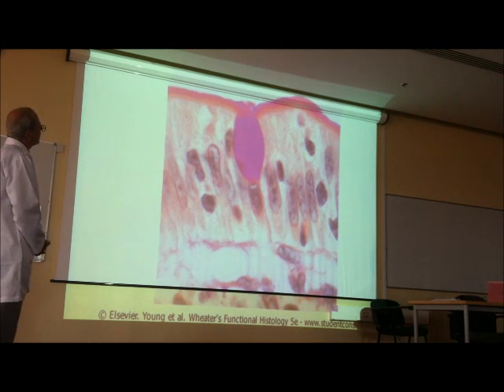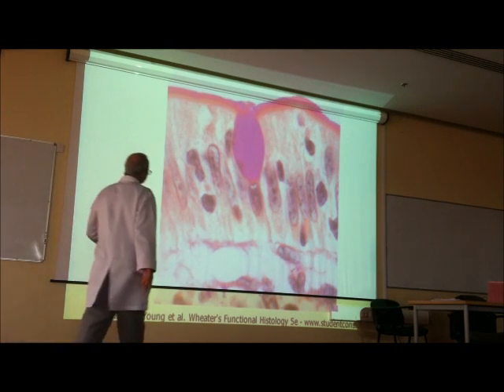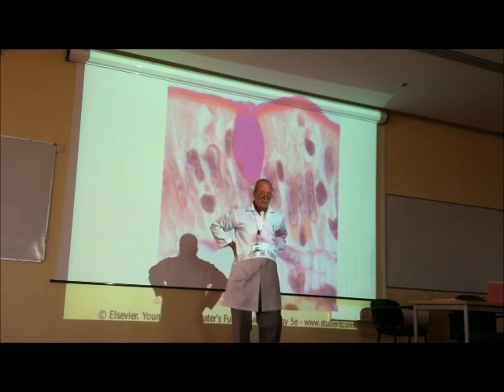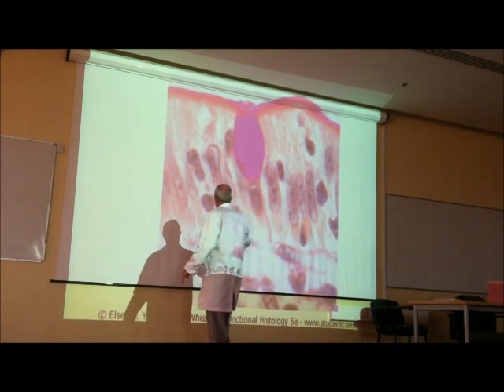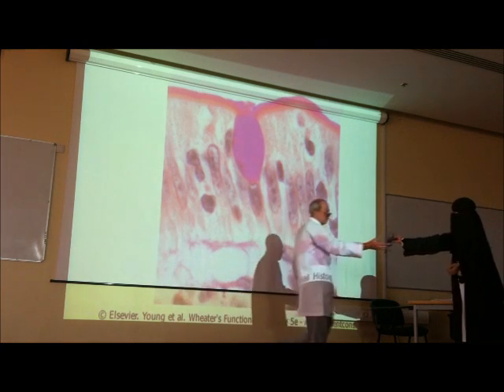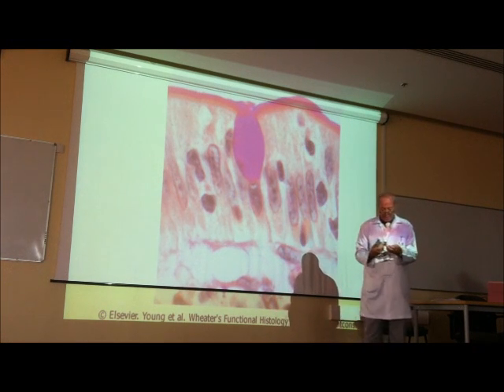It's actually epithelium lining the small intestine. Because what you see around the nuclei scattered at different levels are migrating lymphocytes. Lymphocytes come from the connective tissue and enter the epithelium to defend against microbes present in the gastrointestinal tract.